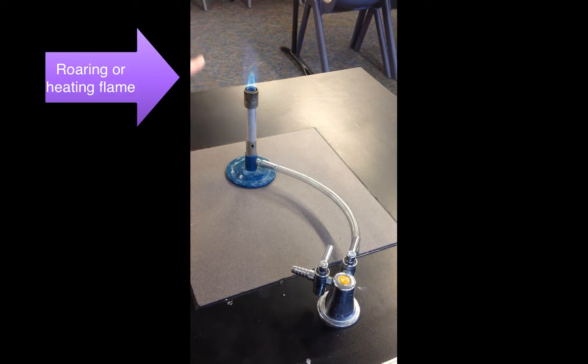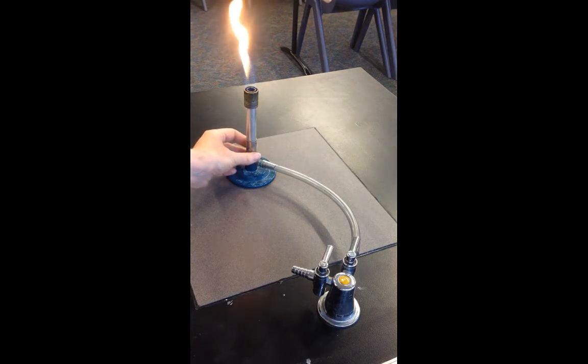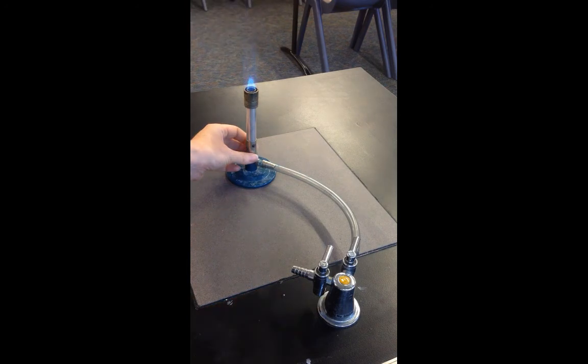The light blue area is slightly colder than the bright blue area, and the hottest part of the flame is at the tip of the bright blue cone. You can practice turning it to a yellow safety flame and then turning it back to a bright blue cone.